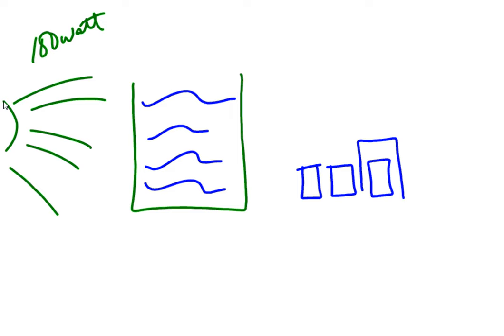As far as your day 2 stuff, it should come along the same lines as far as your basic setup. You're going to have a heat sink, a lamp, and some samples, and then you'll have to recalibrate the next day. But it should follow the basic diagram like we have right here. We have a light, a heat sink, and our samples. And like I said, you're going to be taking samples every 5 minutes for 15 minutes.